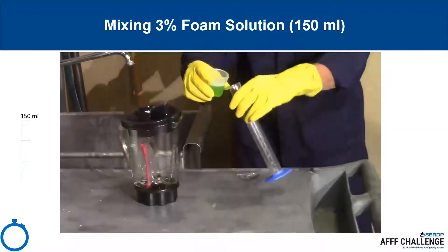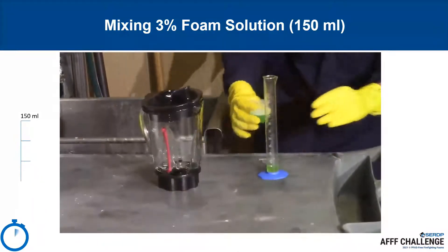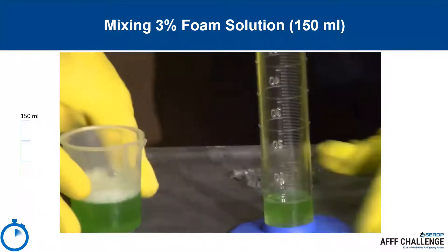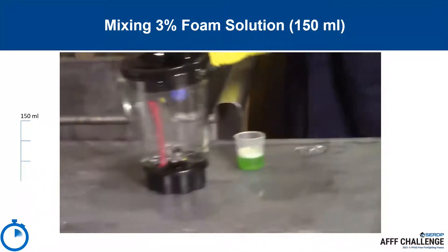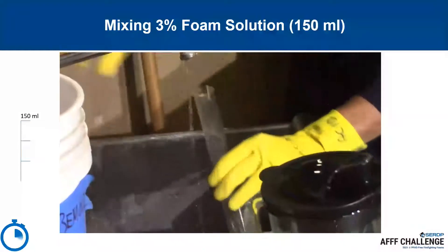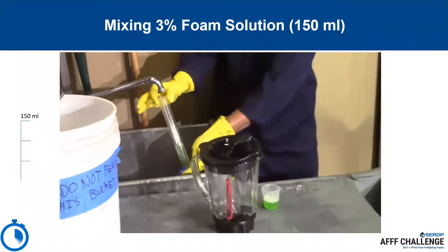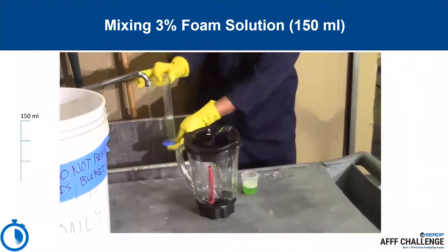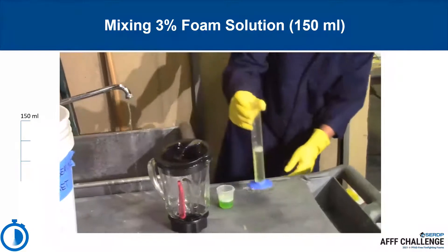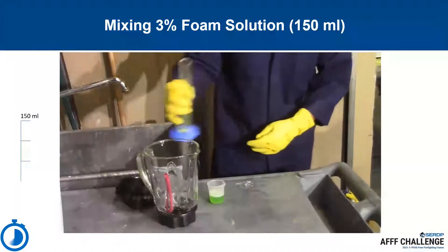This procedure shows how to mix 150 milliliters of a 3% foam solution. Participants will wear protective gloves, safety glasses, and a lab coat for all material handling. Pour 4.5 milliliters of concentrate into the 100-milliliter graduated cylinder. Fill with water up to 50 milliliters, or add another 45.5 milliliters of water, and pour into the blender. Fill another 100 milliliters of water to pour into the blender to achieve 150 milliliters of 3% foam solution. Note some foaming will be seen in this mixture; it is not necessary to pour all of the bubbles into the blender. After mixing, note the consistency of the foam concentrate. This low-viscosity, fluorine-free foam concentrate poured with ease. Other, more viscous concentrates may require longer to pour.